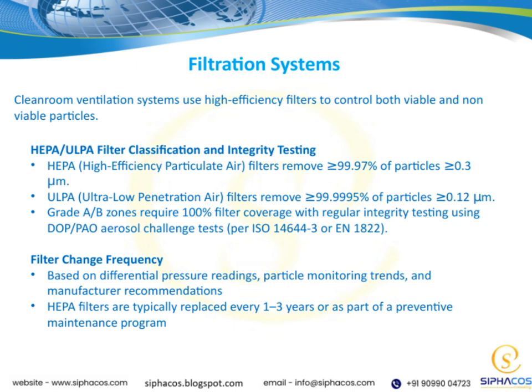Manufacturer recommendations also play a role here. Typically, HEPA filters are replaced every 1 to 3 years, but in some cases, as part of a preventive maintenance program, they might be changed more proactively. Finally, let's touch on filtration systems.